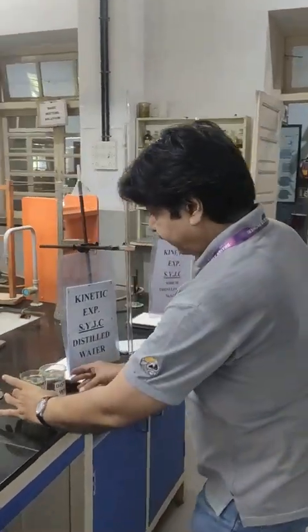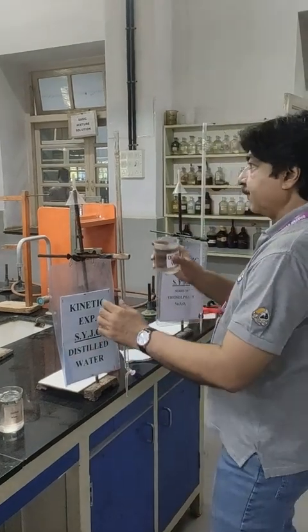Now in the same way we will fill this burette with distilled water.